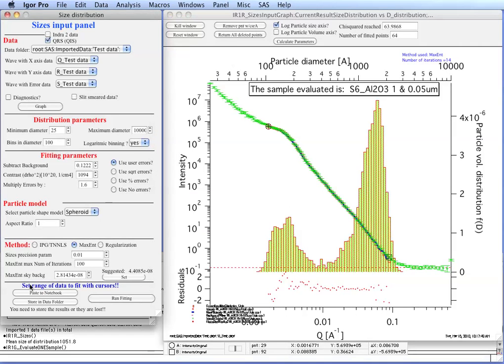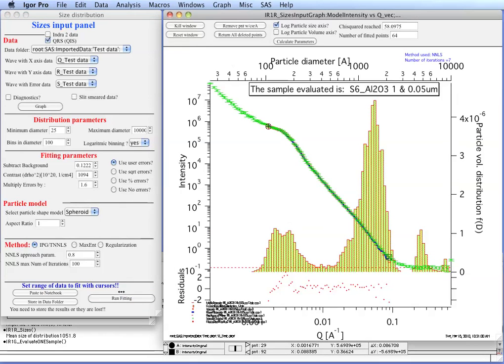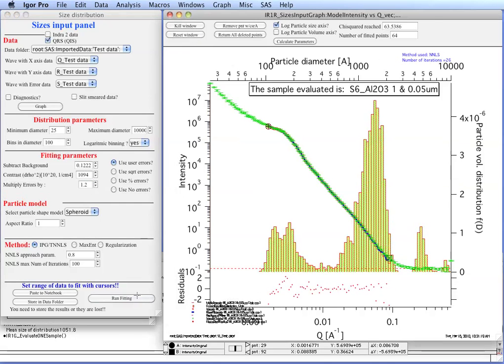Now, you can also use the IPG internal point gradient total non-negative least square method. It has different parameters. And if you try to run fitting here, you will find out that it iterates very fast and you get slightly different looking solution. You need to expect that the error multiplier may be different. Maybe what we need to do is have a lower error multiplier. Now, this method reaches very fast the solution. You can see there are some ringing things which basically look like a reflection of this one at smaller and smaller volumes at larger sizes. That happens often in my experience. If you have a large Q range and large size range, maximum entropy works better. If you have narrower size distribution and smaller Q range data, the IPG TNNLS method works quite well.